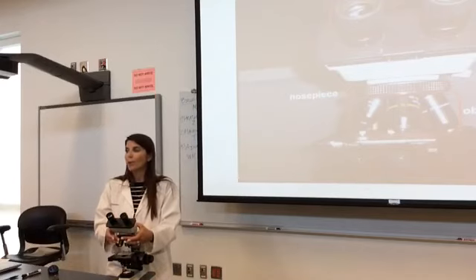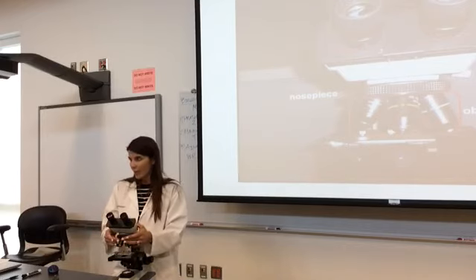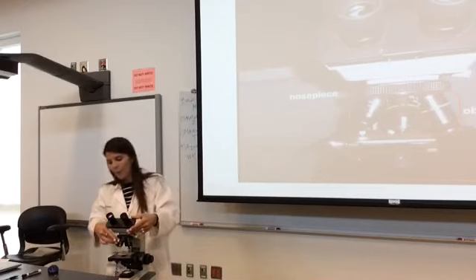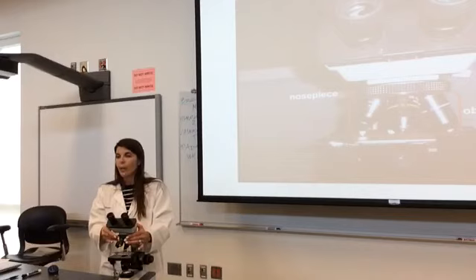Okay? From here, we go to high power. The high power should have the blue band. The blue band is accompanied by the number 40. It magnifies 40 times on its own, times 10 from the oculars. So it's a total magnification of 400. The last objective is white.